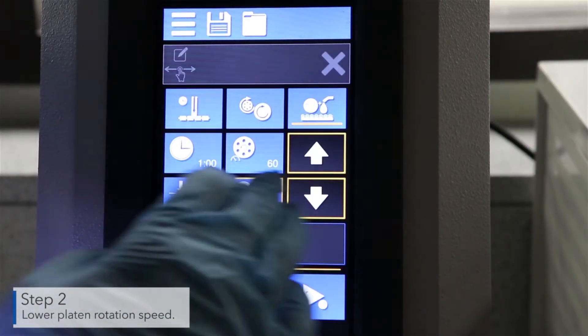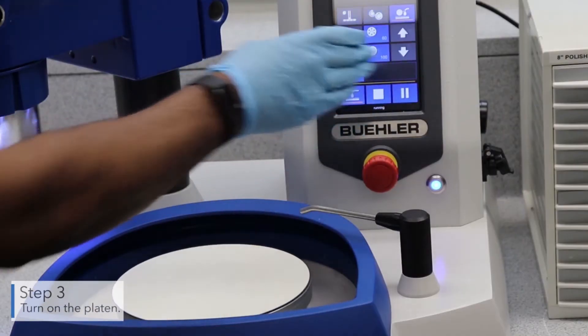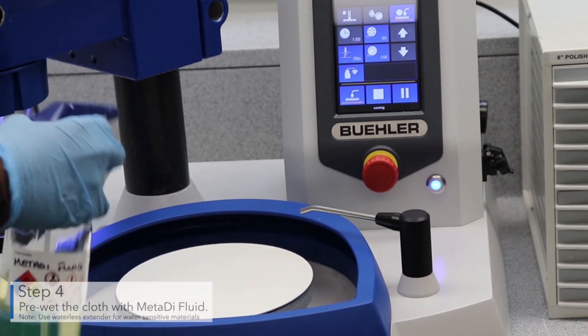Next, lower the platen rotation speed. Turn on the platen. Pre-wet the cloth with metadye fluid.